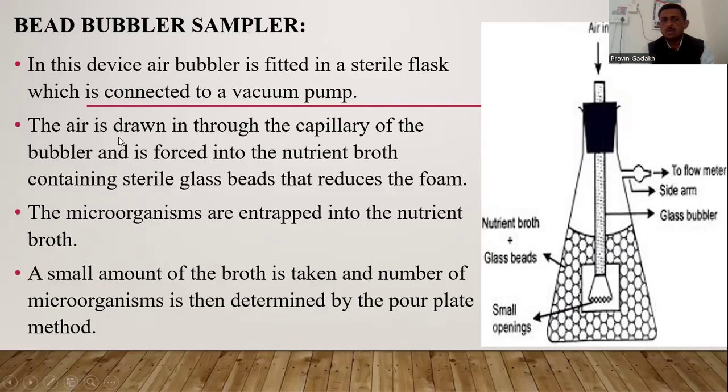The air is drawn in through the capillary of the bubbler and is forced into the nutrient broth, which contains sterile glass beads, which reduce the foam formation.